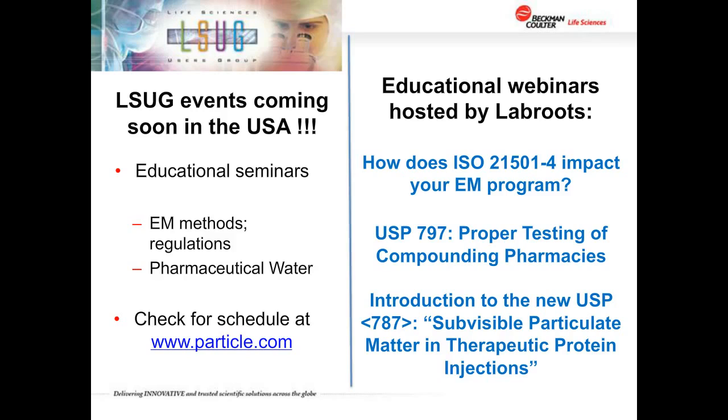It also works out when you look at the formula nowadays, since that limit is at 20, the formula basically also would indicate the need out of ISO to take a cubic meter if you had a target of 20, but that's incidental. So if you're going to call an area grade A, you have to abide by that classification demand, and that would indicate you must take a cubic meter, or at least a minimum of a cubic meter for anything if you're going to later call it a grade A area.